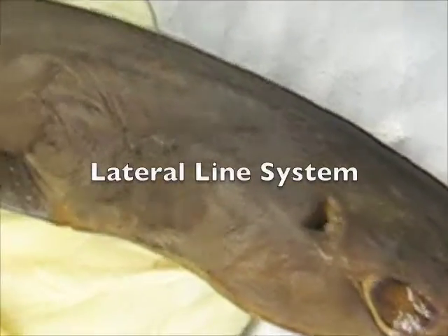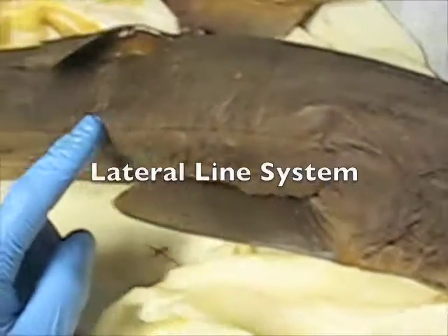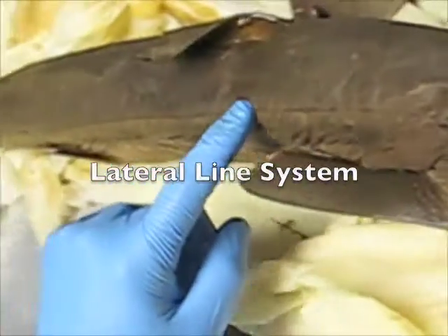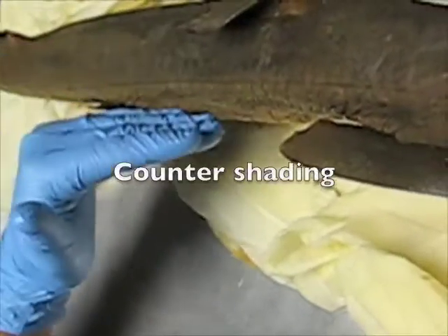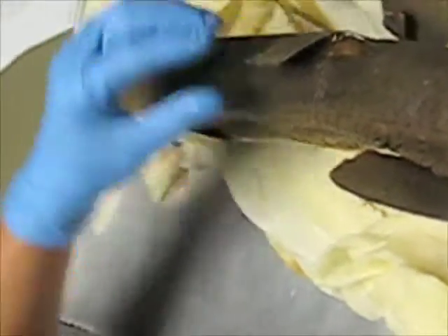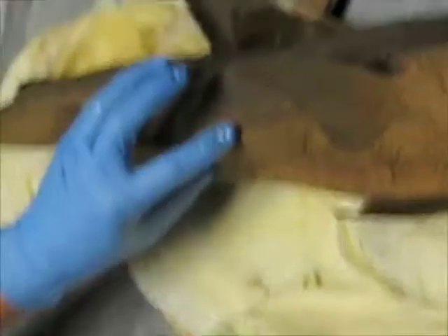There is a lateral line system. I don't know if you guys can see that right through there. That's for pressure detection. All right. They can pick up the pressure. They also have counter shading. All right. So notice that they're dark on top, but they're lighter color on the bottom.